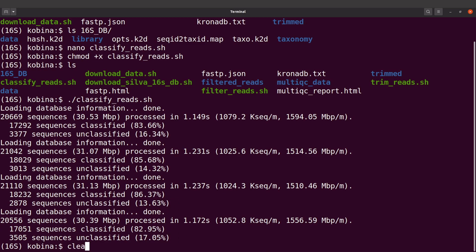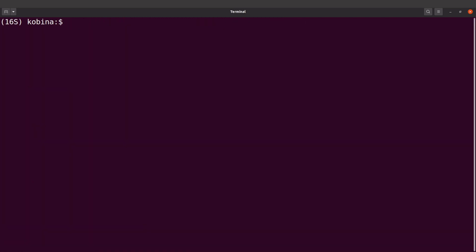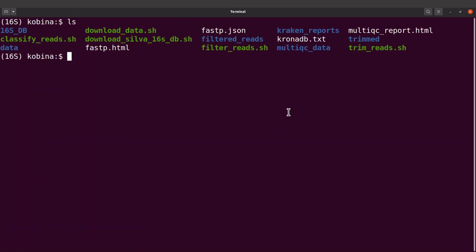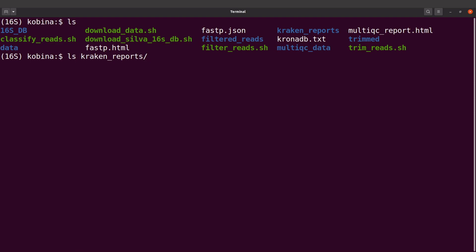So let's check the outputs. The outputs can be found here. If you do an ls, you will find this directory called kraken_reports. You can say ls kraken_reports, and we are going to find the files there. We have 8 files, 2 for each sample.